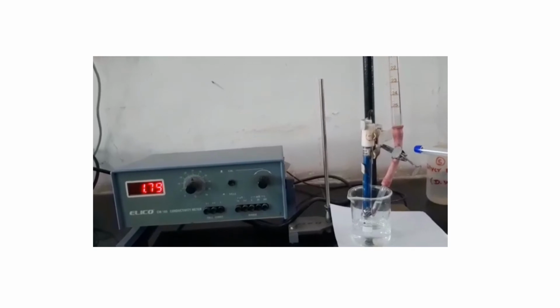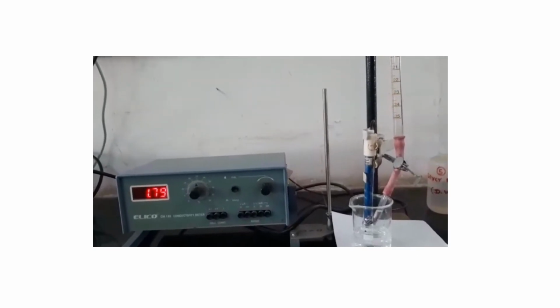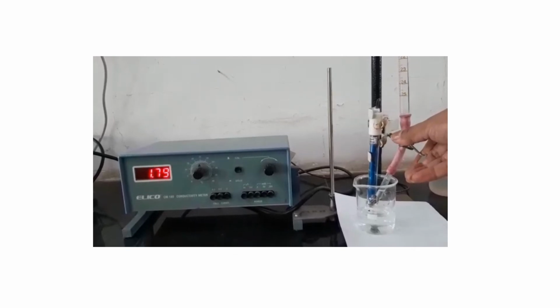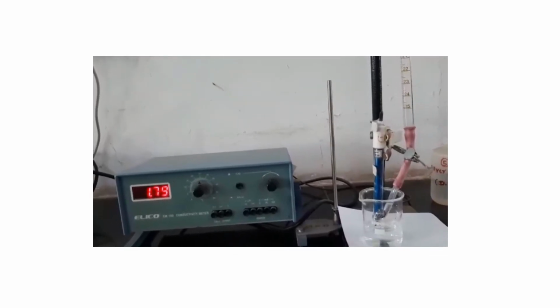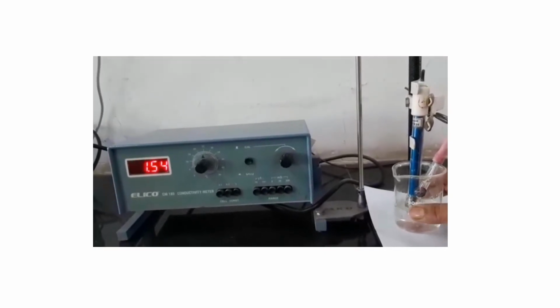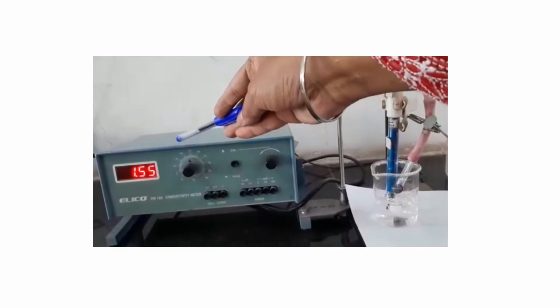Now add 0.5 ml NaOH solution from this burette. Now shake the solution well and note down the conductance.